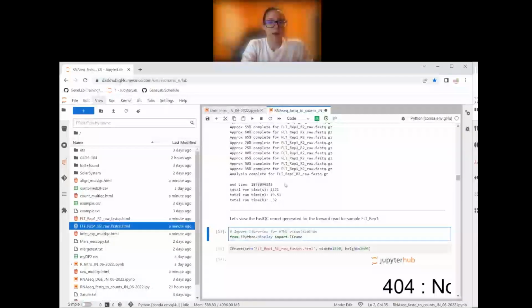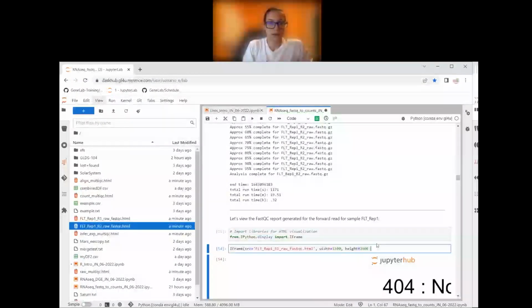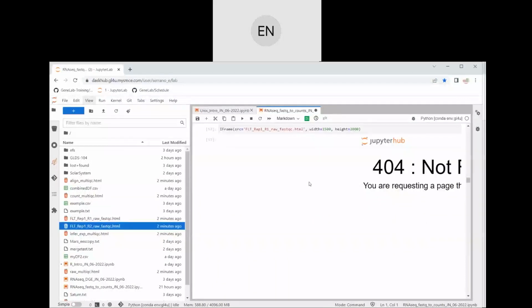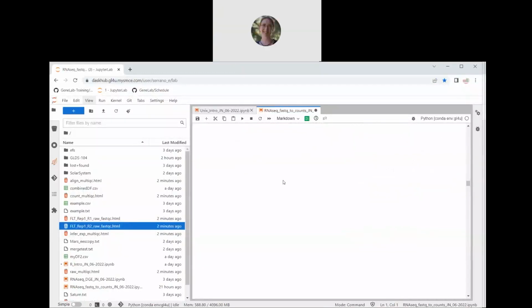It says this one, import. I run that one, and then I go here and run this one, and it says file not found. Lauren, do you have any idea why she wouldn't? I can't see an obvious reason. Yeah, I'm stumped. You have the file?